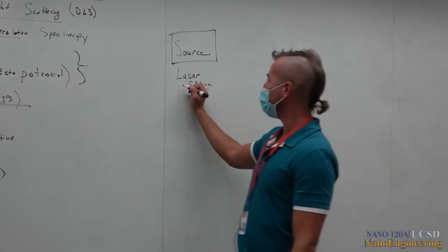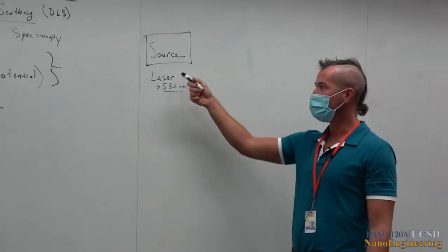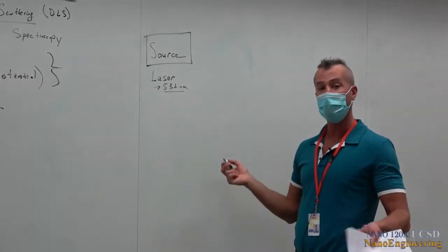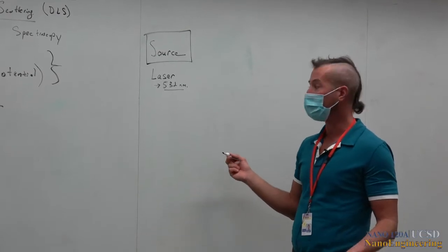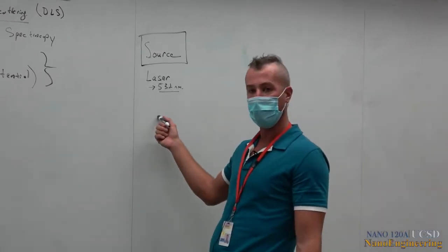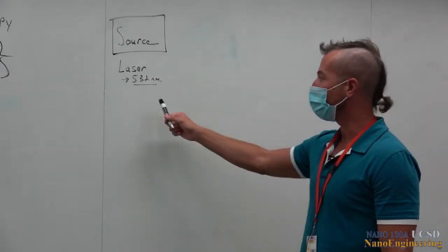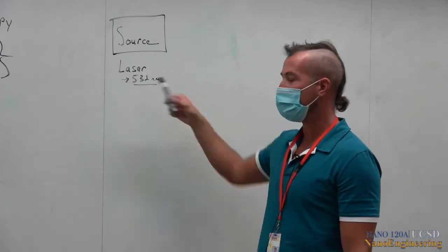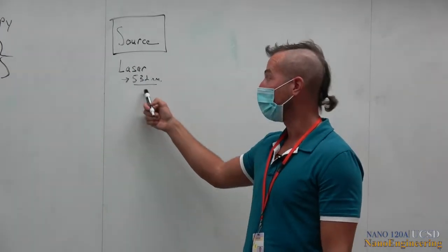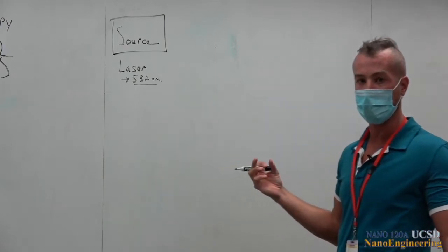This is a consideration in terms of how you make these systems sensitive to a wide range of particles, right? And so one of the discussion questions is a thought experiment about how you would make your system sensitive to a wider range of particles and increase your sensitivity, okay?